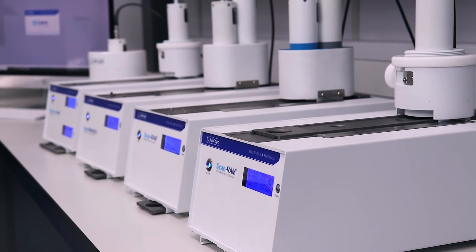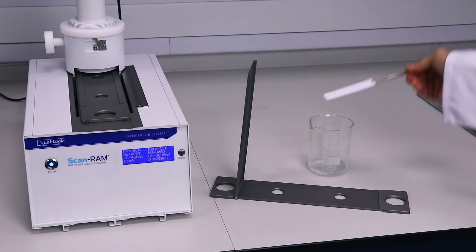The ScanRAM range from LabLogic includes four models. All of the ScanRAM models provide accurate results for radiochemical purity testing. Let's have a closer look at some of the features and benefits.